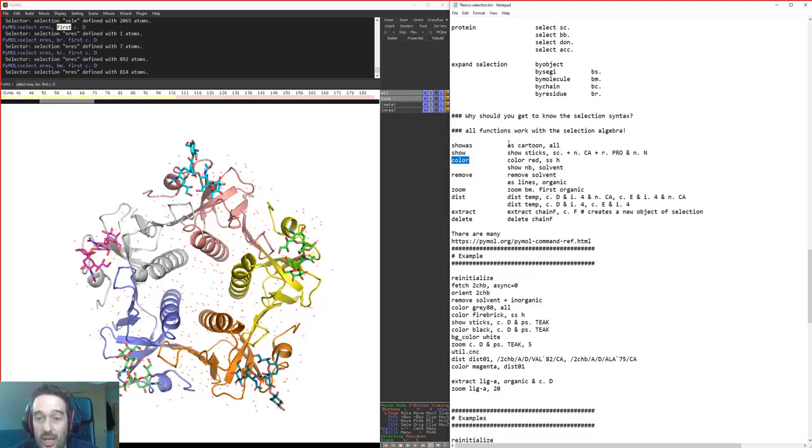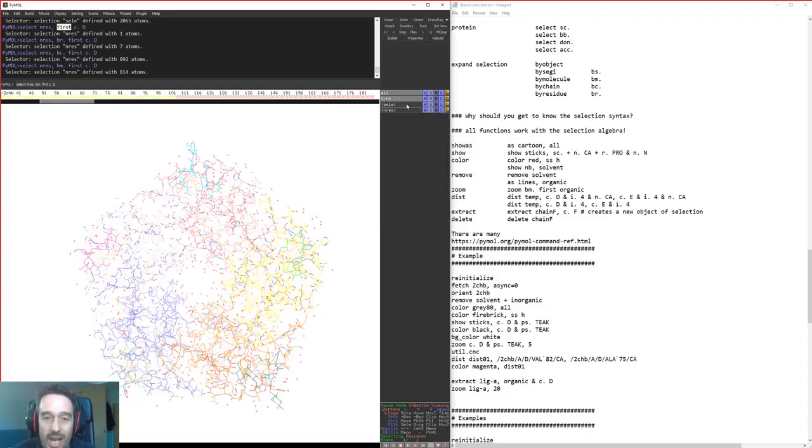So, for example, last week I told you that you can have this show, which adds a representation, or we can go to show as, which then replaces a representation. Well, we can just type as cartoon and then have our selection criteria that we've been discussing. So we can say as cartoon all.